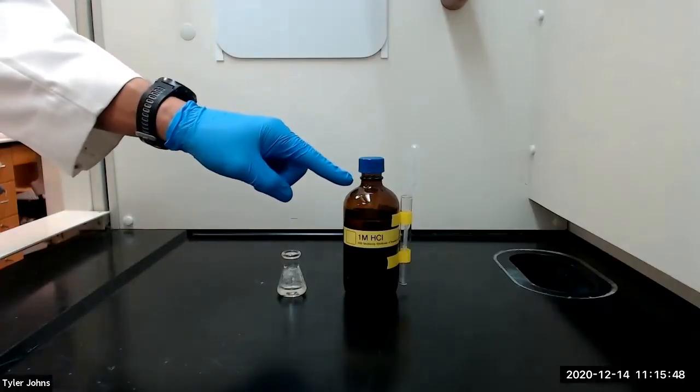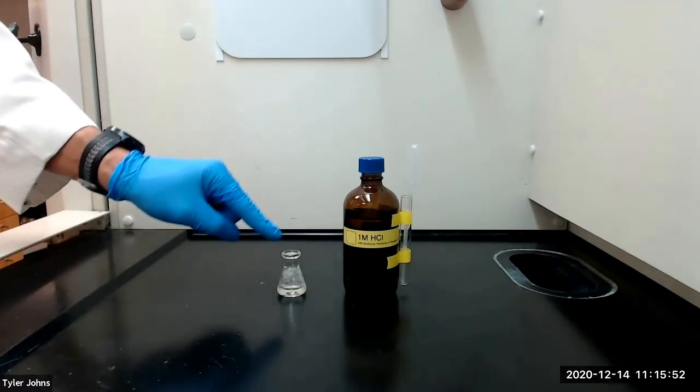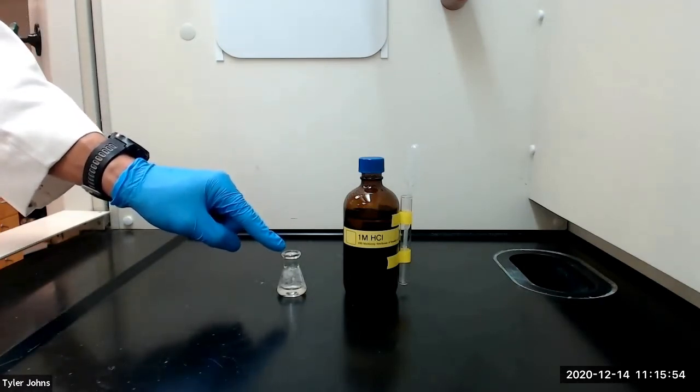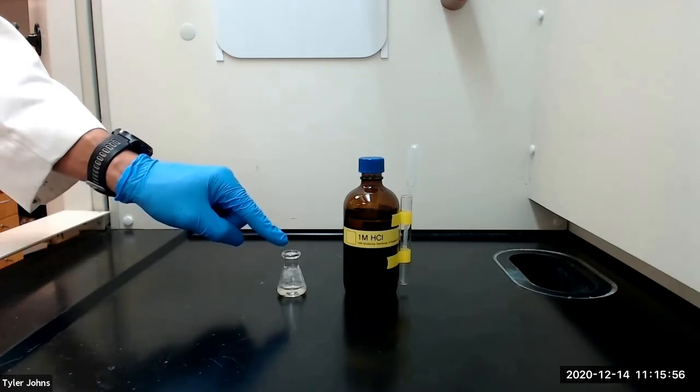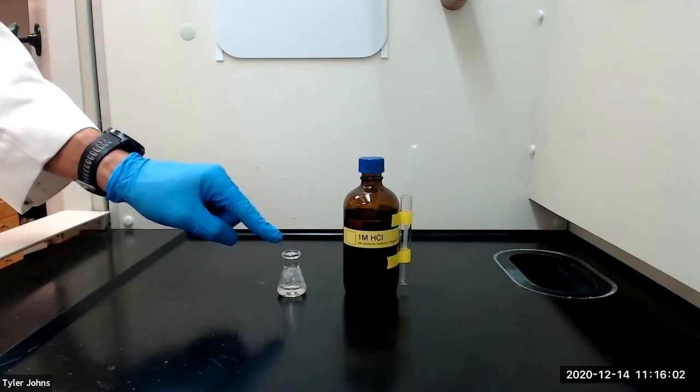We will next add 0.5 milliliters of one molar hydrochloric acid dropwise to the solution with swirling. As the solution becomes acidic, solid benzylic acid will begin to precipitate. The final pH of the solution should be about 2.